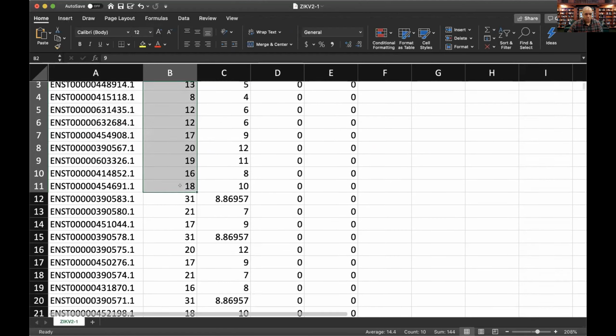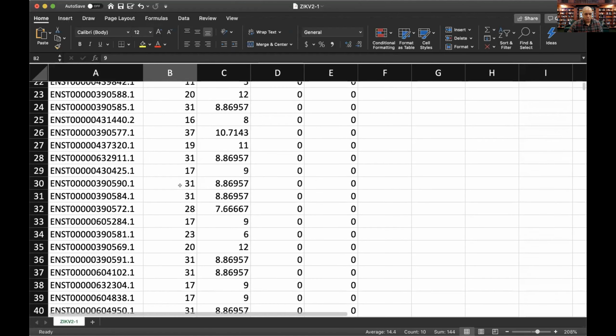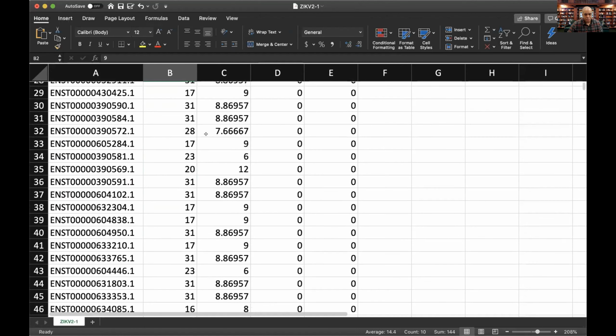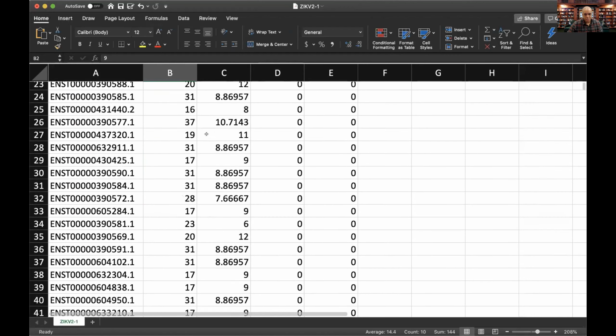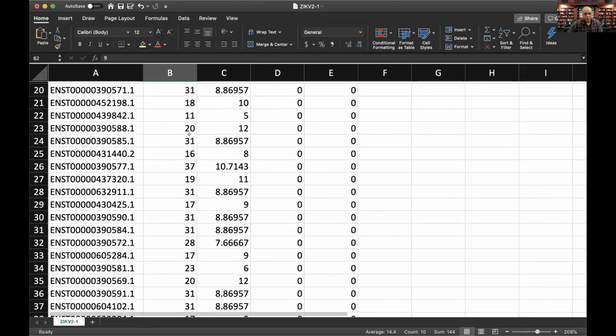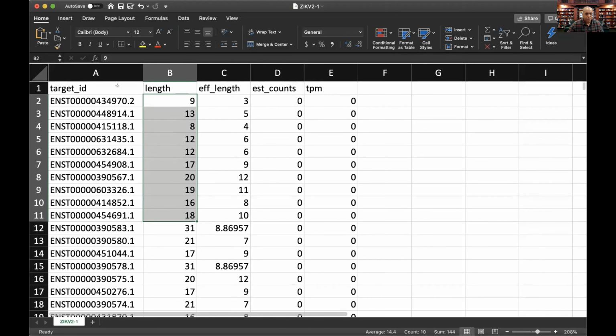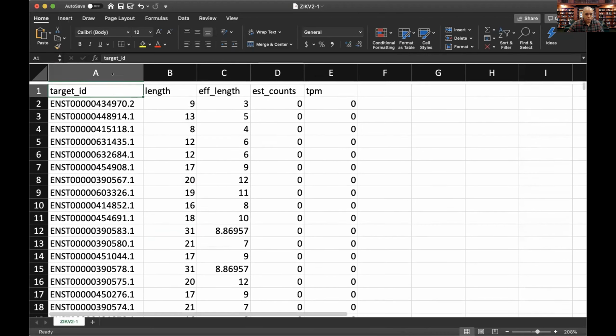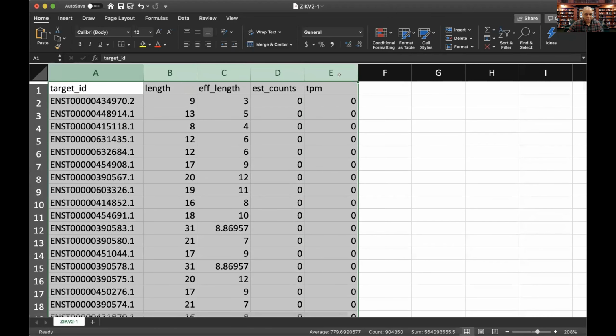You can see, for example, the length of these transcripts here is pretty small, right? So it's not surprising for these smaller transcripts. Maybe these are things like microRNAs, which can be around this size. It's not surprising that we don't see very much. But we can do some filtering, and although this is not a lesson in Excel, you might know some details.